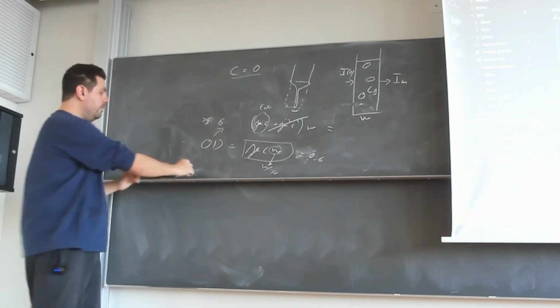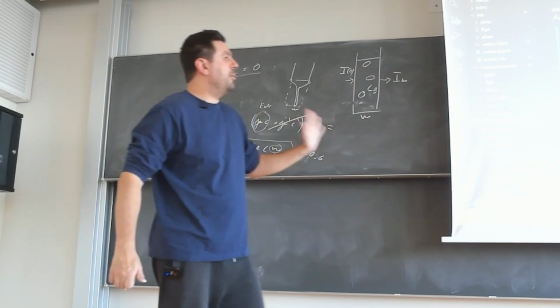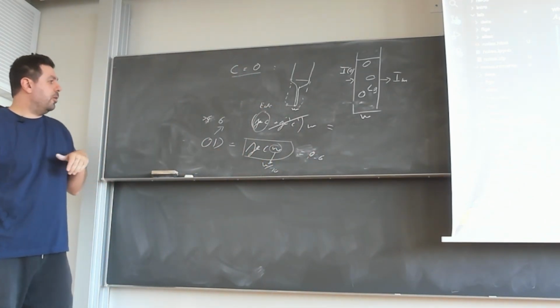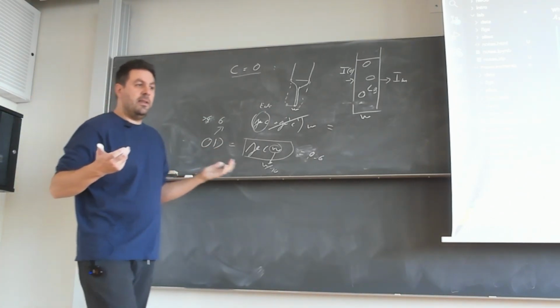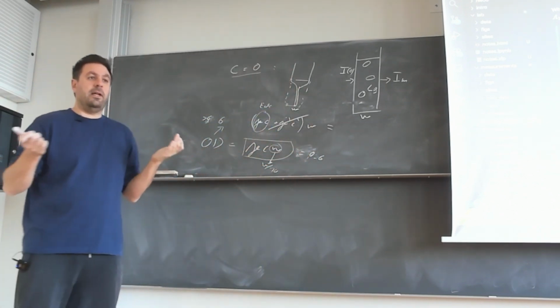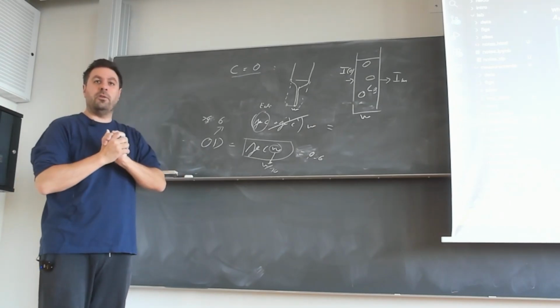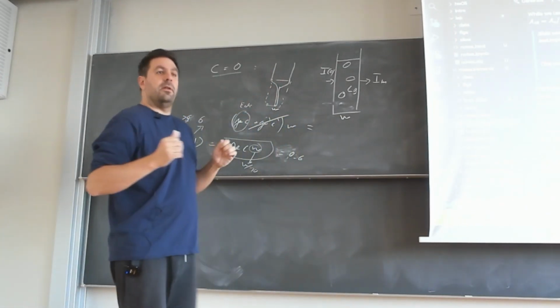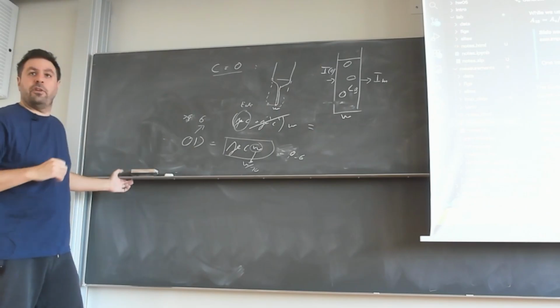So this brings me to the end of absorbance and optical density measurements. Optical density is the slightly more general principle than absorbance. Absorbance was taking away light, for example, by sand particles, and optical density also takes into account this random diffusion of light, like with E. coli. They don't absorb light, they refract light, but still it makes such a measurement possible with this Beer-Lambert law, essentially, or the very simple generalization of it to a medium.